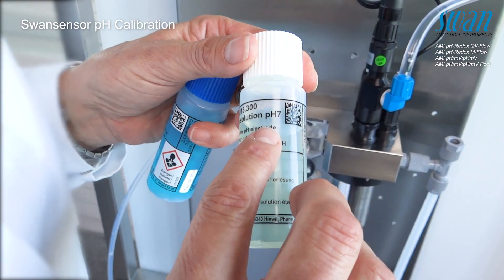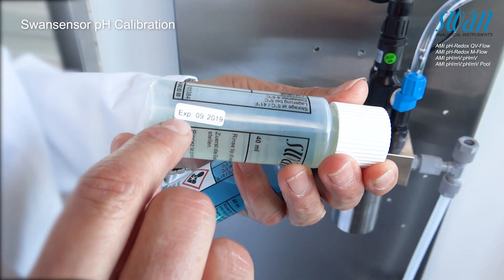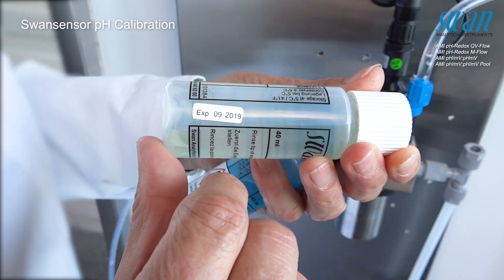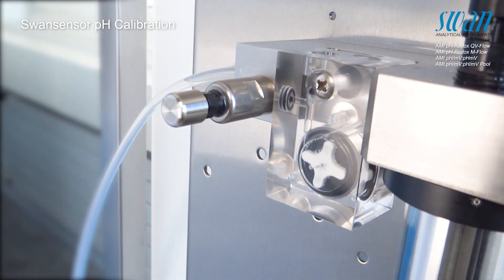Check the pH value and expiry dates of the two standard solutions. Stop the flow by closing the flow regulating valve.